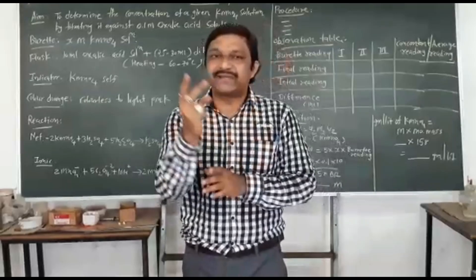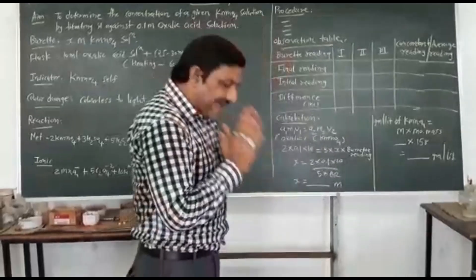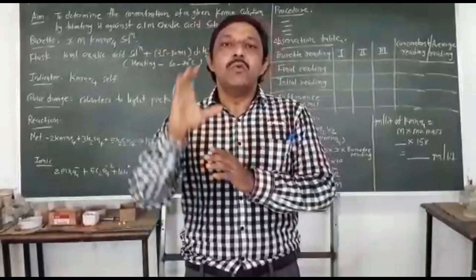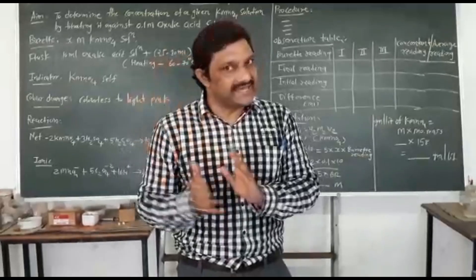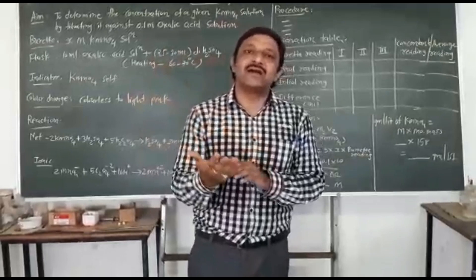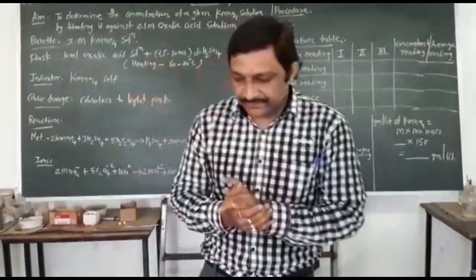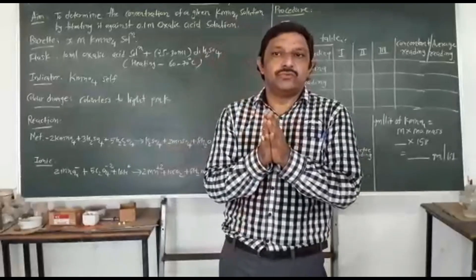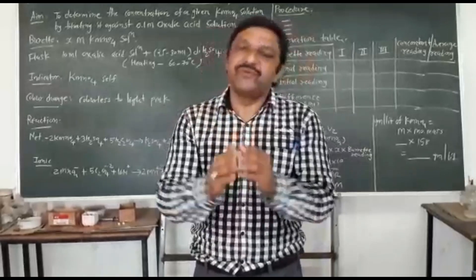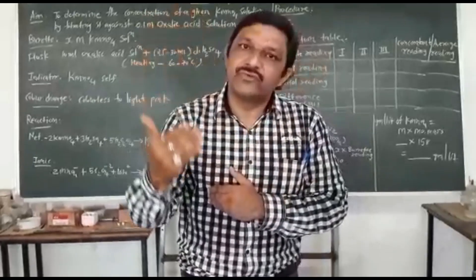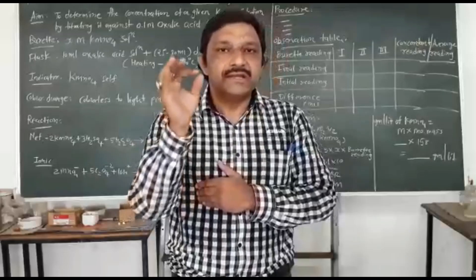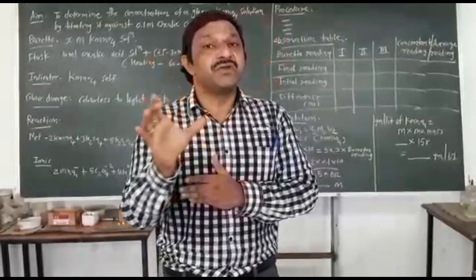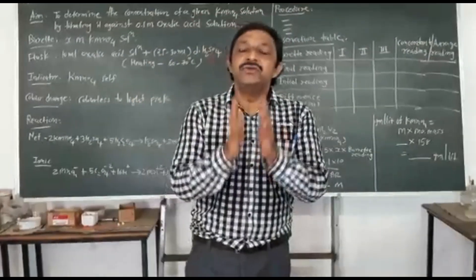Today we will perform the second practical — practical number two: x molar KMnO4 vs 0.1 molar oxalic acid. This is your second redox titration. You have to fill up your burette with x molar KMnO4 solution.